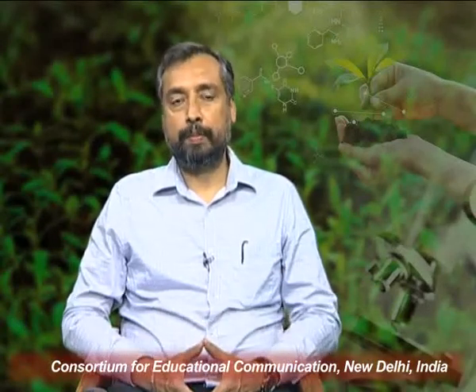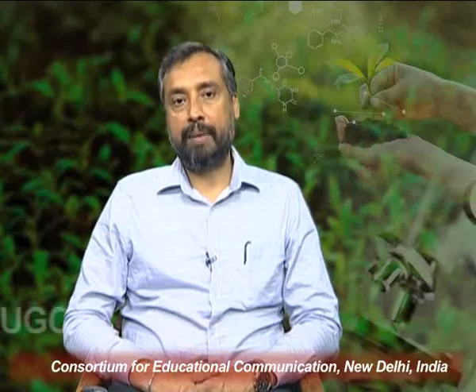Now the second component of a light microscope is the stand. This part of the microscope holds all the components firmly in their position. There are two basic types of microscope stand: an upright one or an inverted one.